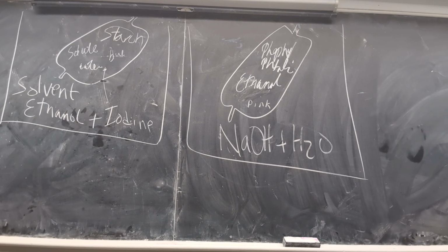Very good. Now you're going to make a second one. Okay, and I'm going to show you how to open it. It's enough, it's not going to leak out, you're good. Next. Excellent. Now we're going to open this: wet the top of it. If you wet it with water, it's going to start to come out. So just wet it with water. That's easy.